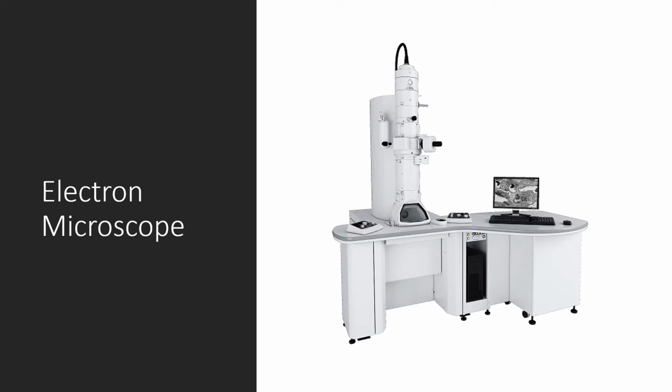And I also hope that transmission electron microscope parts and working is crystal clear in your mind. But if it's not, put your doubts in the comment section, see that video again, and if it's still not clear, please see some animated videos, then it'll be crystal clear in your mind. But with that, let's start with the scanning electron microscopy.